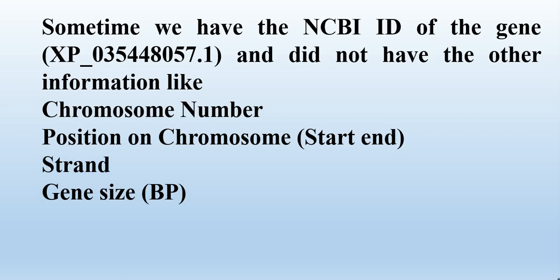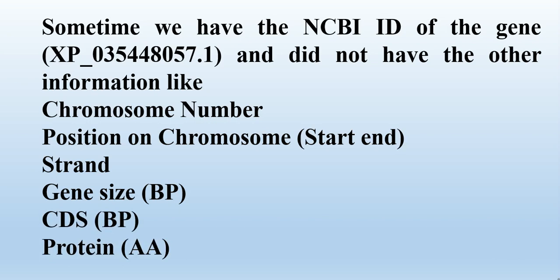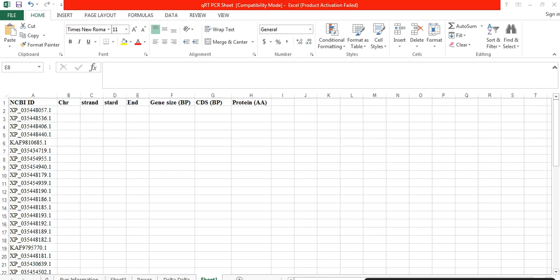And its strand - whether it is on the forward or reverse strand - and gene size in terms of base pairs, CDS, and protein in terms of amino acids: how many amino acids are present in the protein sequence.